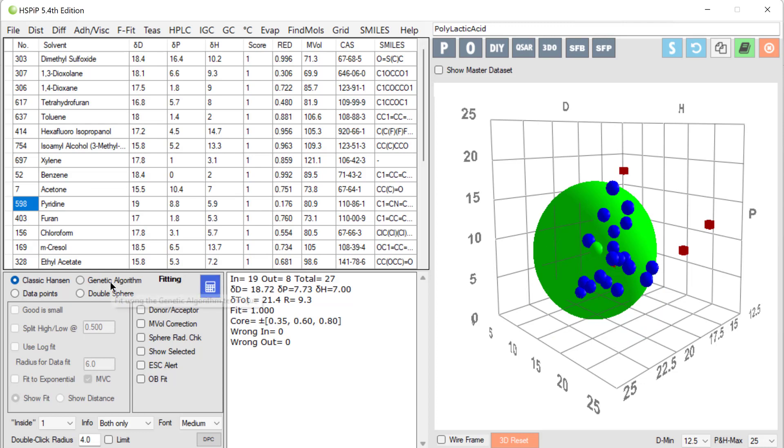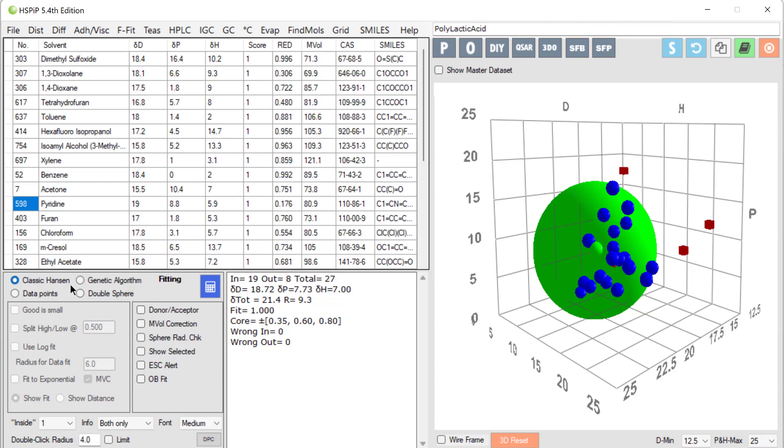In other cases, I prefer the genetic algorithm fit. We're trying to capture complex phenomena as best we can in a practical sense so we can use these data. So choosing genetic algorithm or classic Hansen is not a problem. It's an opportunity for us to use our chemical knowledge and intuition.